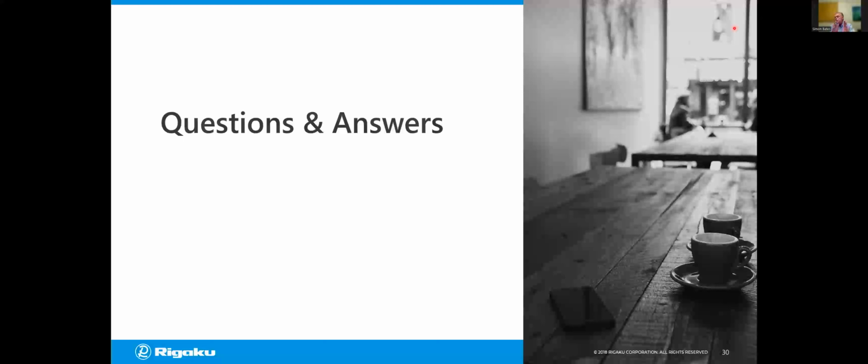So let's say you put your material in and it changes from A to B, and you run these snapshots very quickly over a period of, let's say, 10 minutes, so you get multiple snapshots. Then the cluster tool will separate the data that's essentially A and the data that's essentially B. So you'll end up with two clusters of data, each essentially the same type. Those can be averaged automatically by the software, and you can use those as components. So although your material is changing from A to B, you've got a component for A and a component for B, and you collect it on one sample by doing multiple snapshots over time. And that tends to work pretty well.